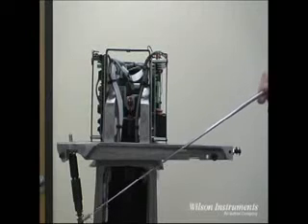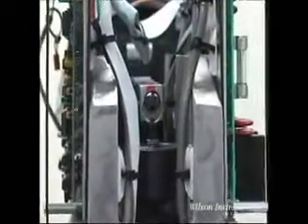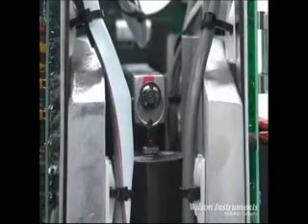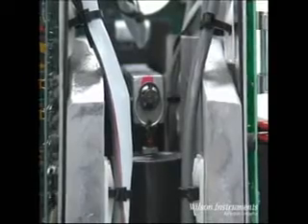This major load is mechanically applied, usually by deadweights in a lever system — a reliable and proven method to apply and hold a test force. The deadweight system utilizes a series of incremental stacked weights attached to or hung off of a lever and pivot point to apply a magnified test force at the indenter rod. Once minor load is reached, a motor or dashpot system releases the deadweights in a downward motion for the duration of the specified dwell time.